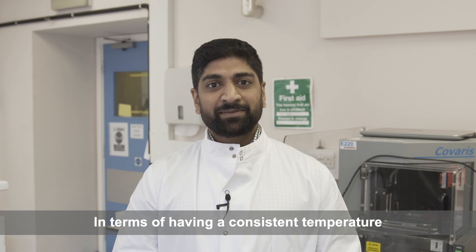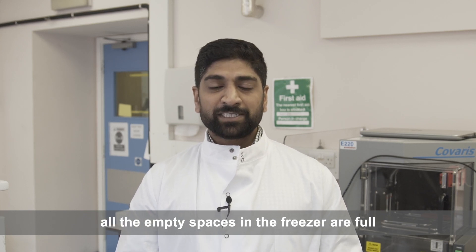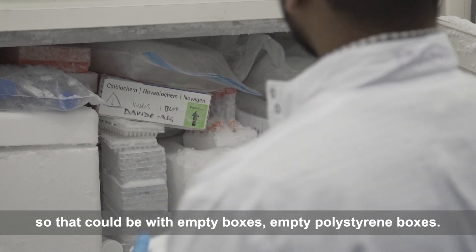In terms of having a consistent temperature, the best thing to do is to make sure that all the empty spaces in the freezer are full — that could be with empty boxes or empty polystyrene boxes.